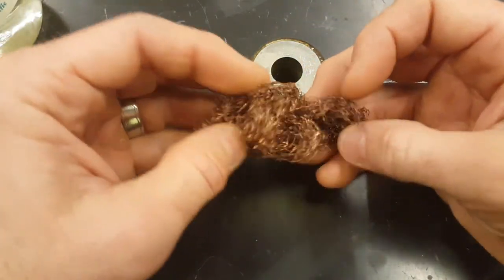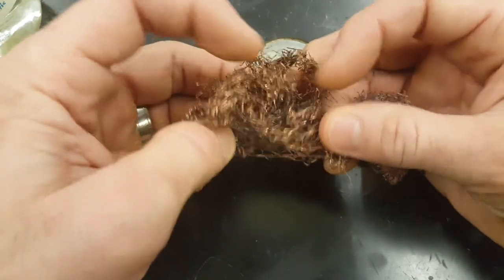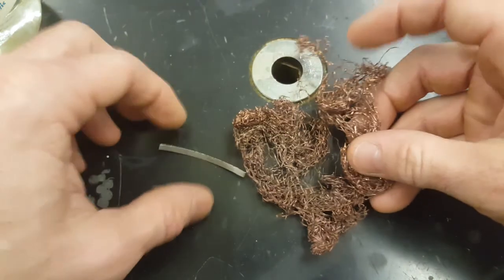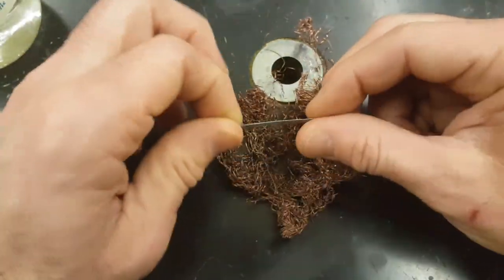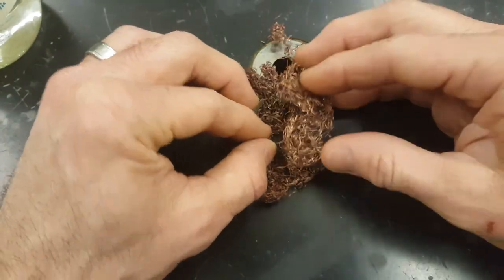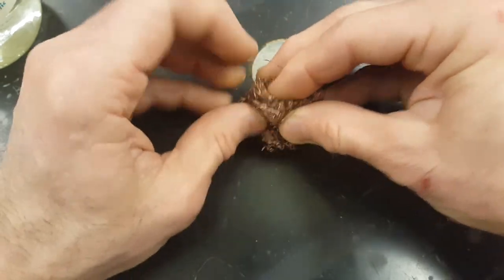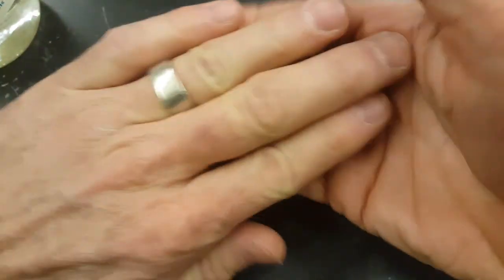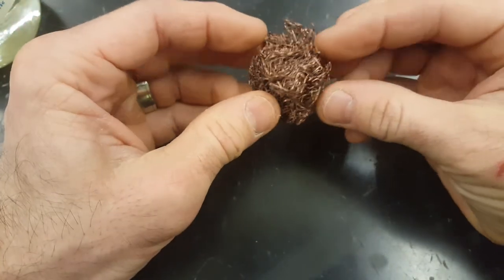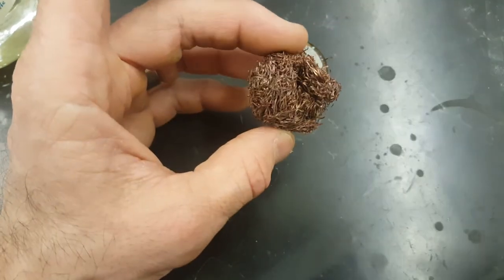Now for more of the fun part. You'll have some copper chore boy. The copper doesn't react fast enough with the hydrochloric acid for this reaction, but the magnesium does. So we're using the copper to wrap the magnesium. So you make a nest for the magnesium, wrap the copper around it, roll it into a ball, and you shouldn't be able to see the magnesium in there. It should be buried inside. I'll show you what to do with this.